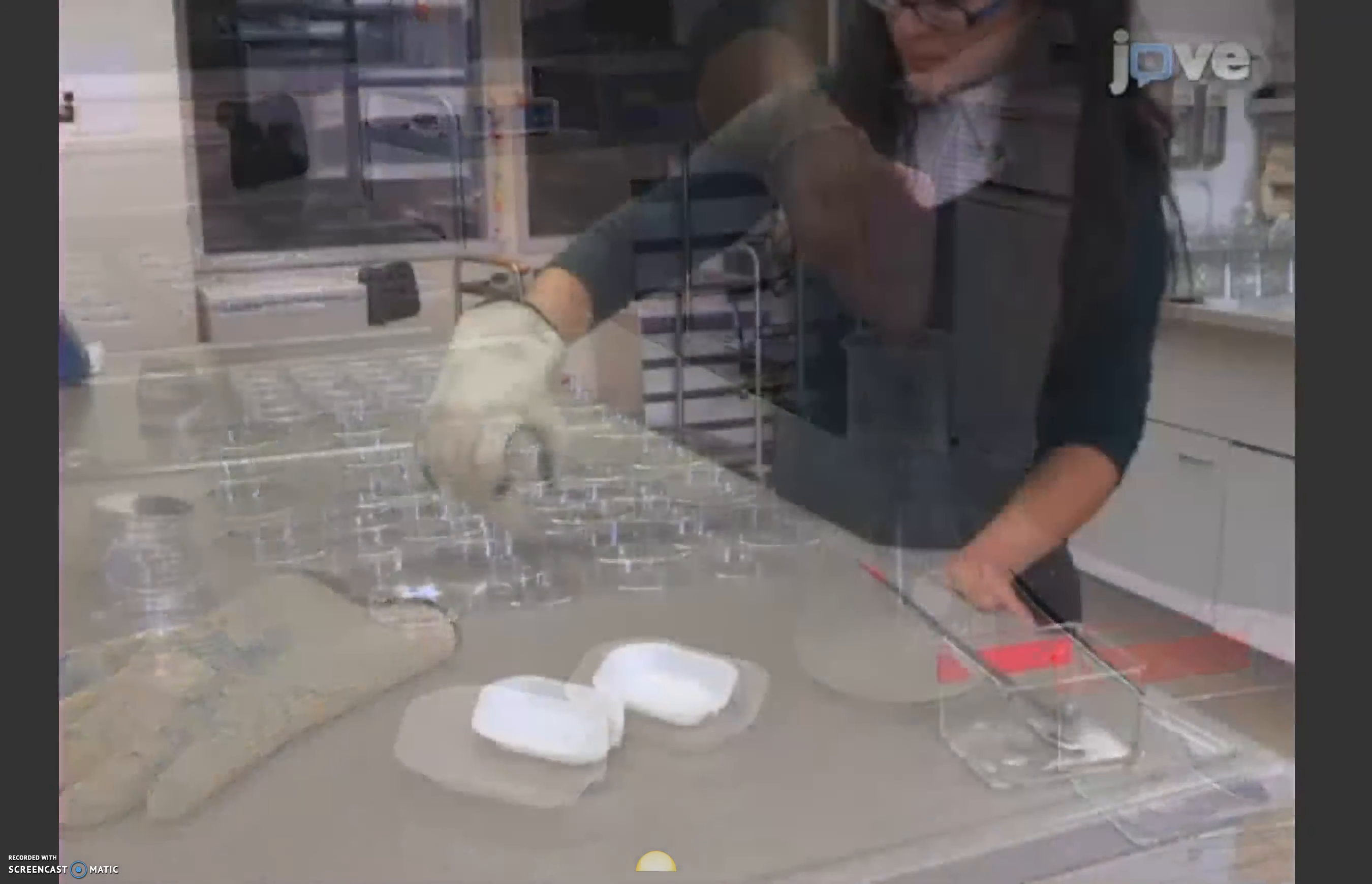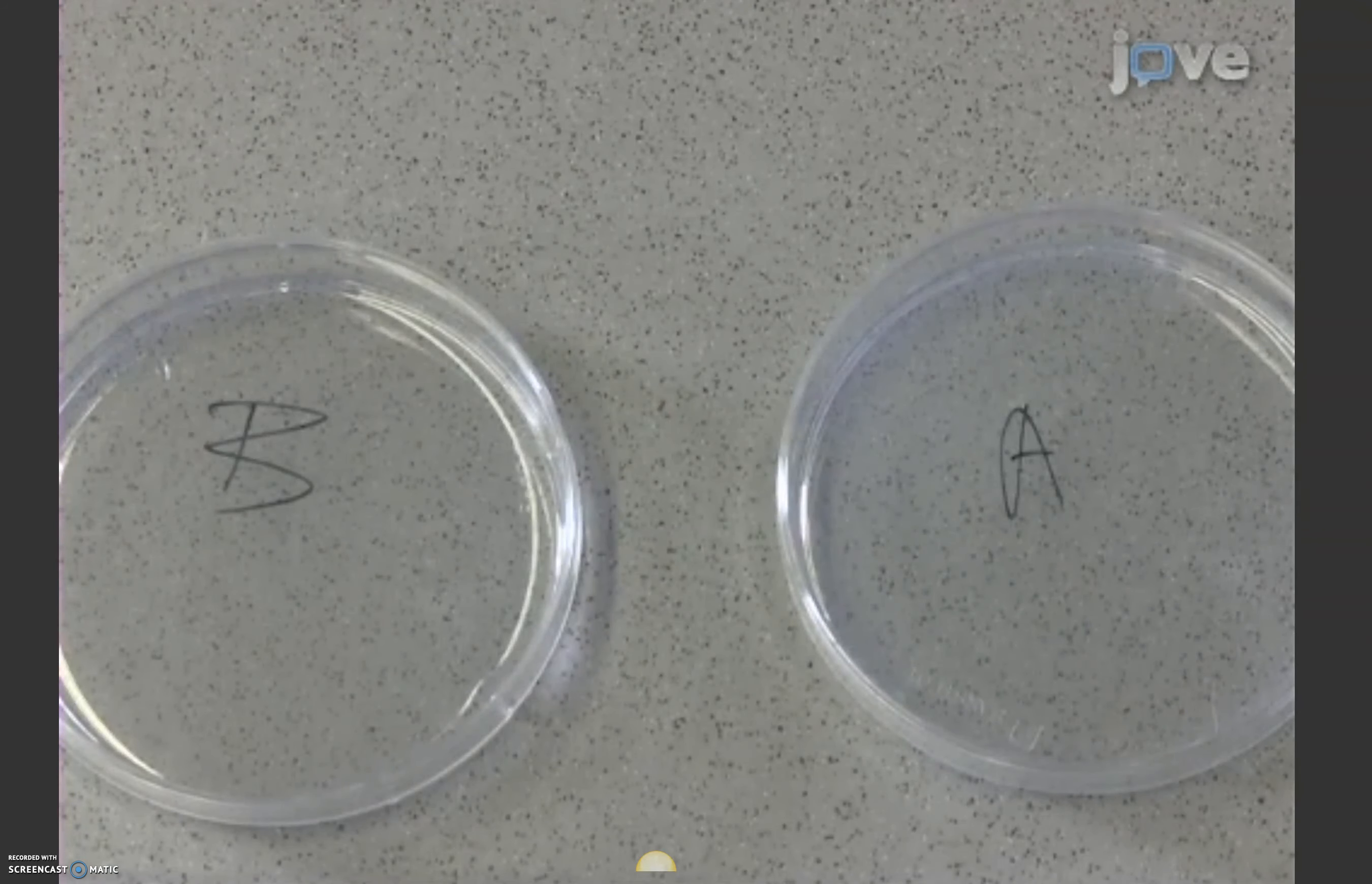Next, label each of these dishes with a different symbol that will blind the experiment. The fructose-containing dish is the conditioning reward, and the plain dish is the non-reward.